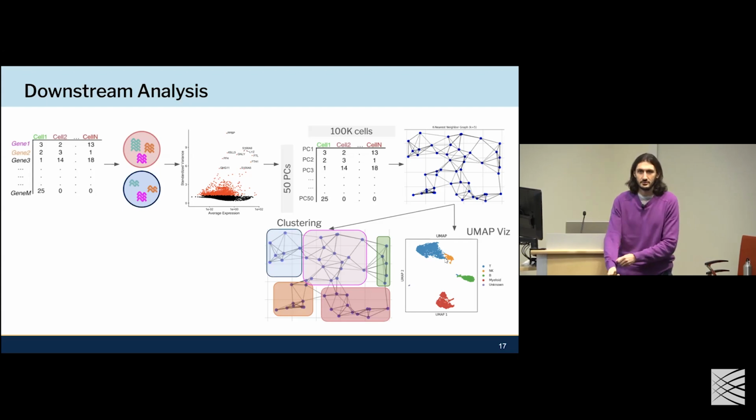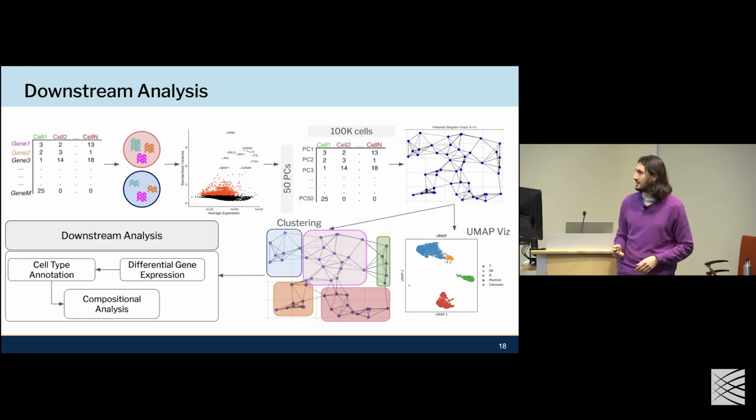So just to not overinterpret UMAPs, they can be useful to look at the data and just have some visual reference, but yeah, don't judge distances and relationships. And if you see 4 clusters right in a row, don't assume that this is one transitioning space that's going from one to the other, because basically you're compressing 30,000 genes into 2 dimensions. There might be a lot that's missing there as well.